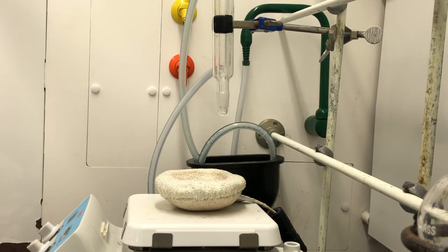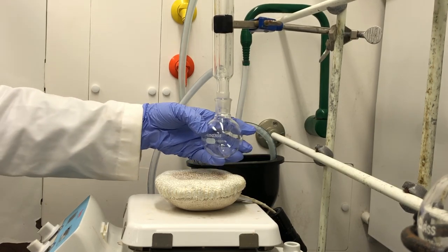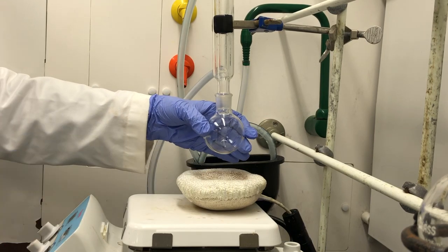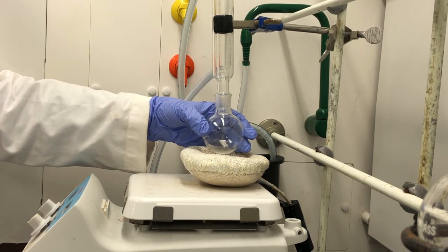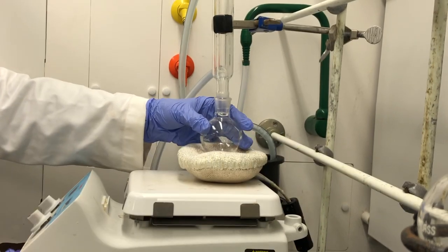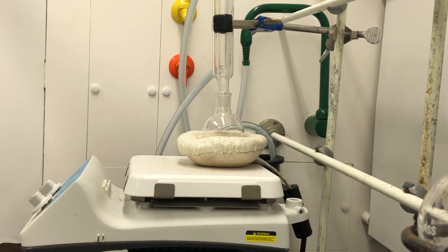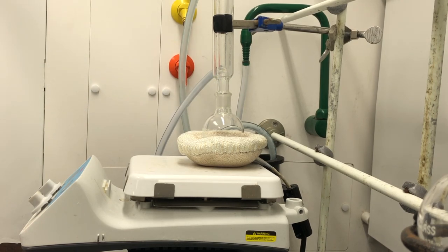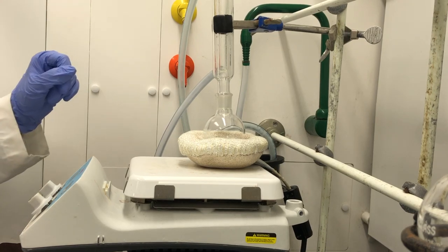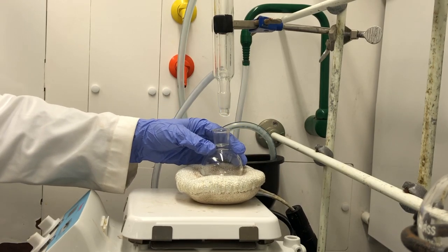Next we have the round bottom flask. We're using a 100 mL round bottom flask and we're going to attach it right to the condenser. You want it at a height so that if you needed to remove the heat, you could very quickly remove the reaction mixture from the heat source. We'll need to grease the glass joints after we put in our reaction mixture. So now the setup is basically ready and we'll go and measure our starting material and place it in the round bottom flask.